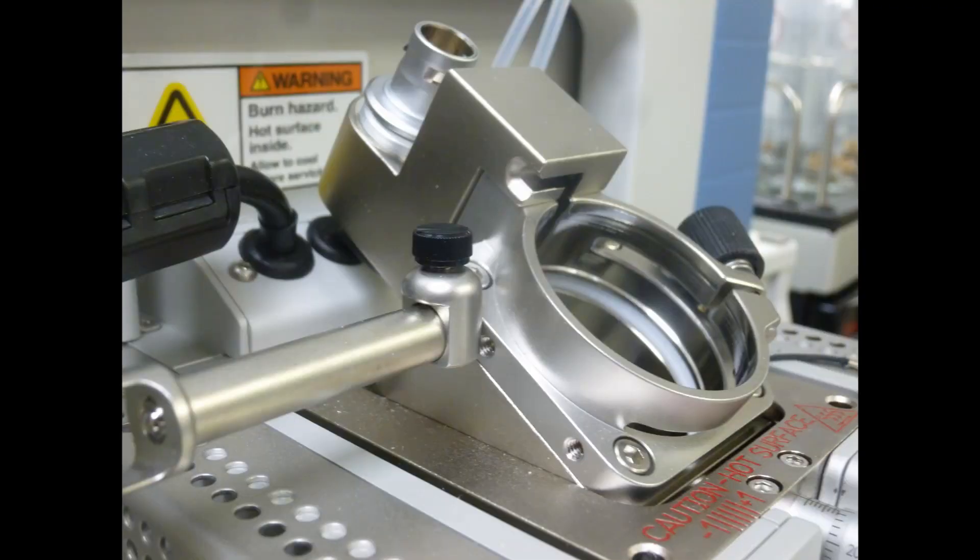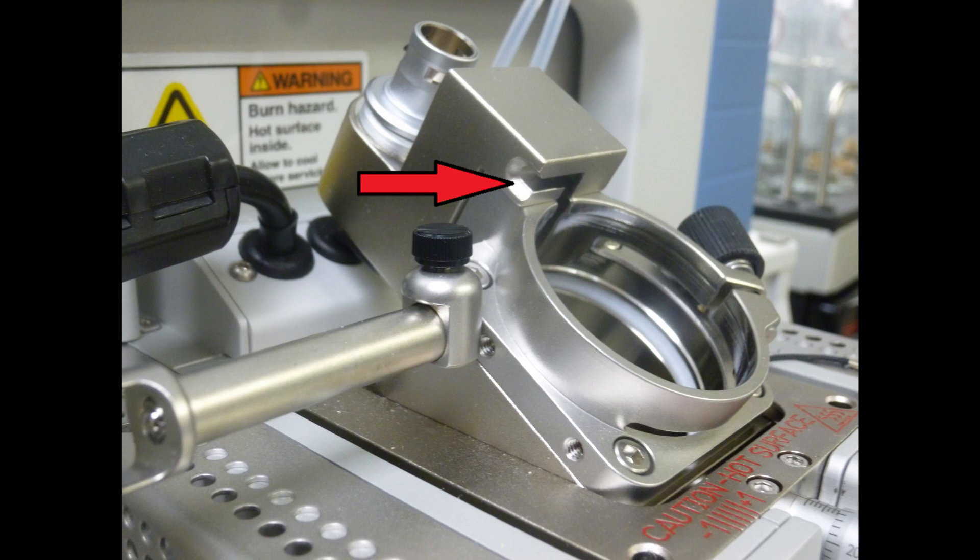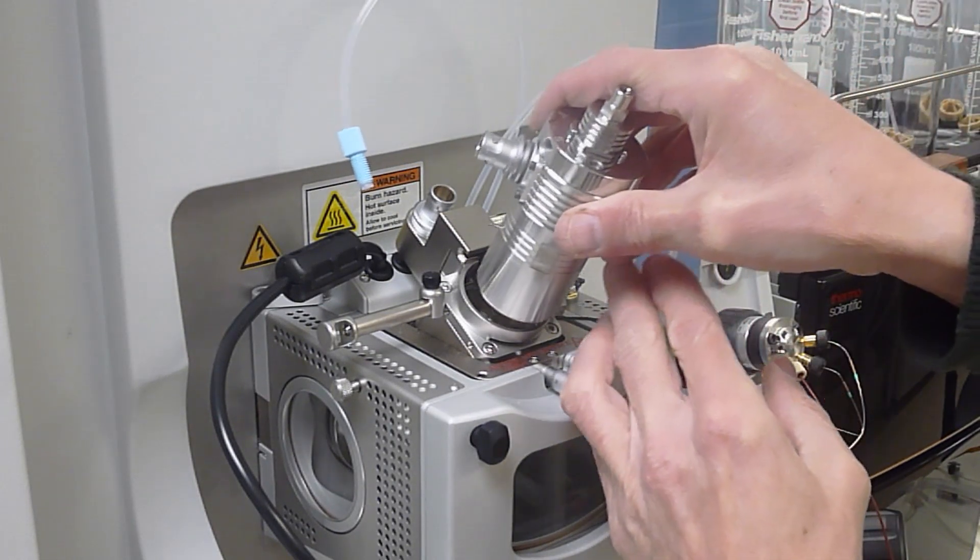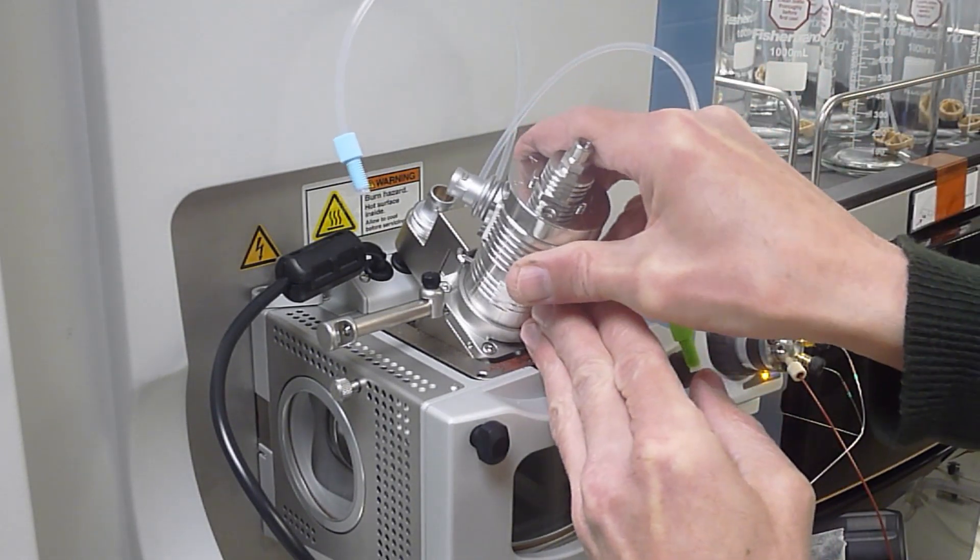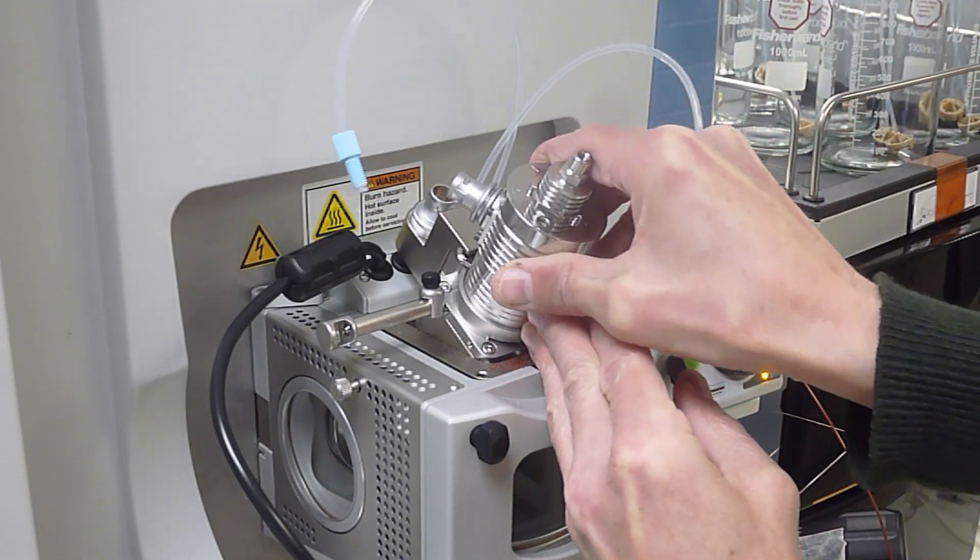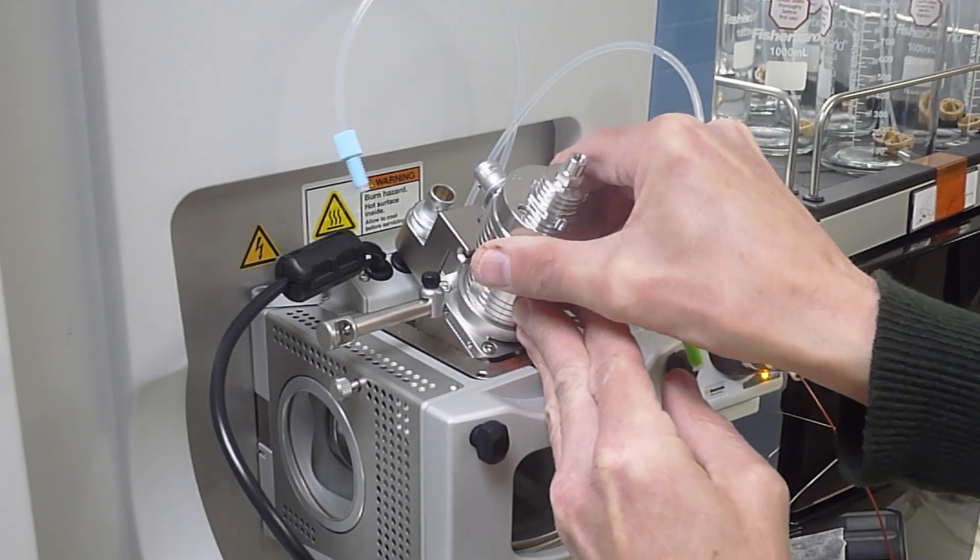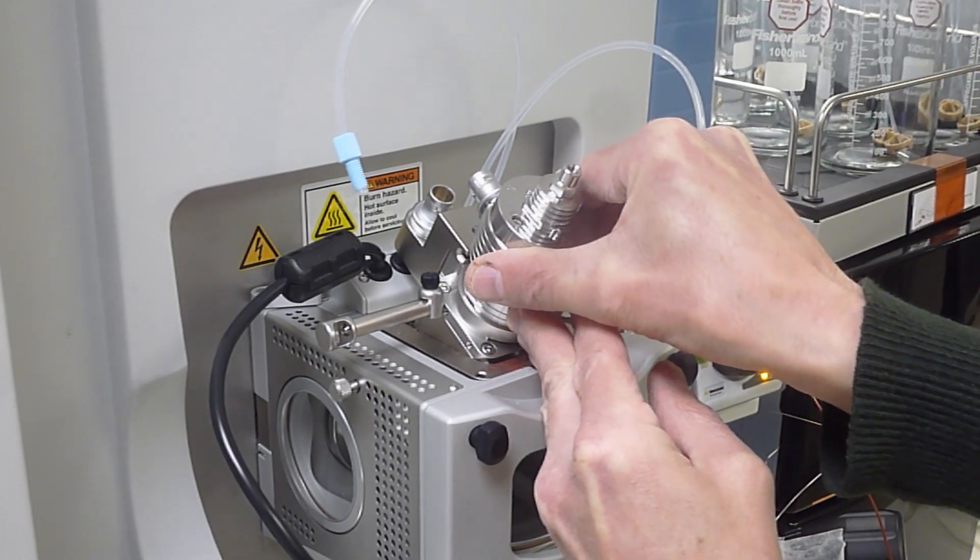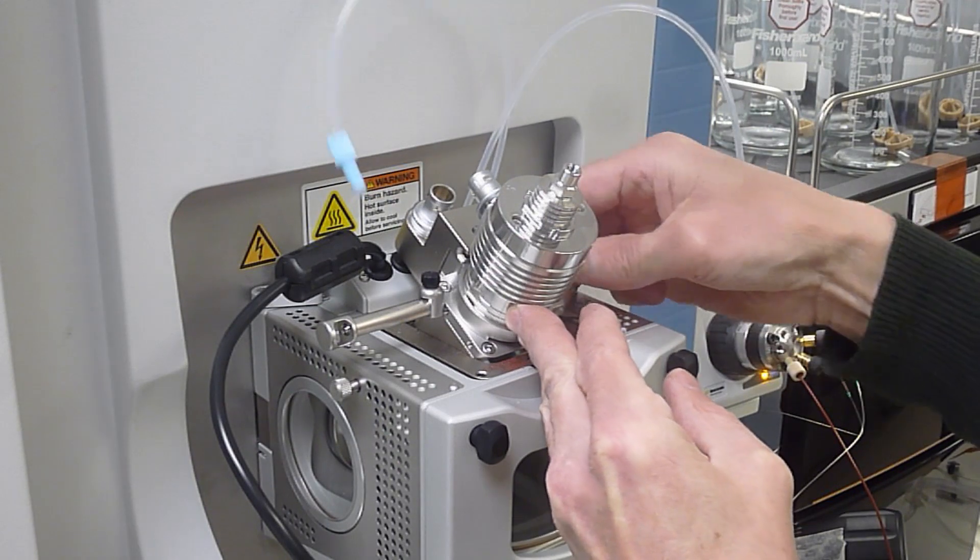Next we're going to fit the APCI probe. There's a pin on the probe that fits in the slot that you can see on the left side of the holder. Insert the probe, get the pin into its slot, rotate, push the probe further down to the correct position and then tighten the collar on the right hand side.